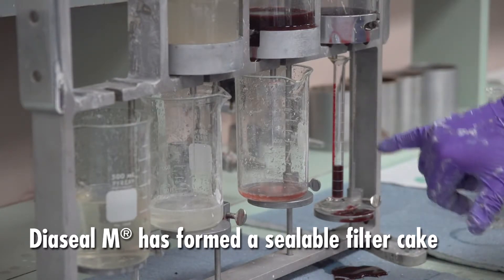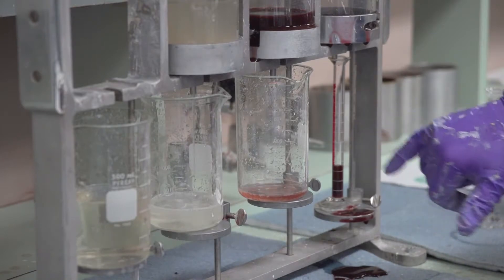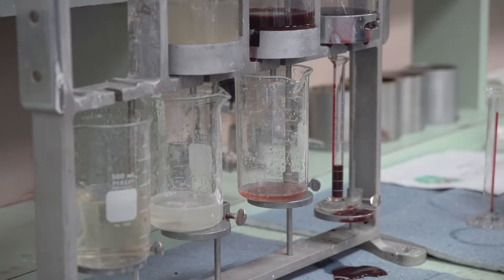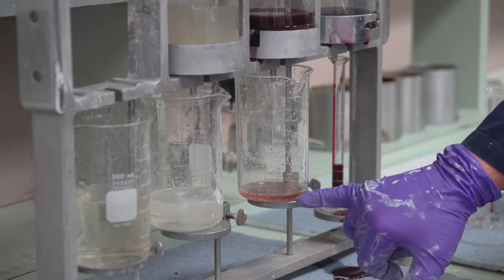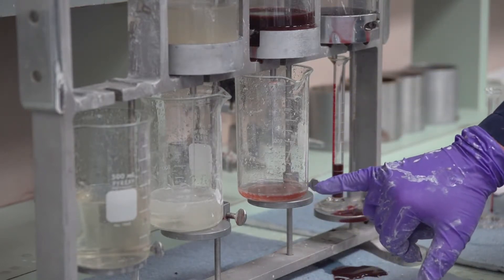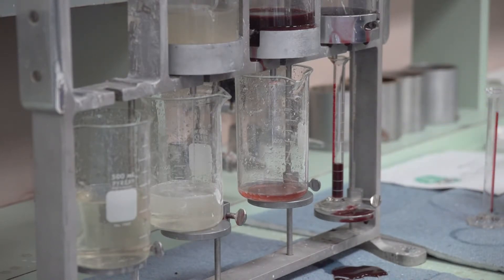You can see the mud itself, if we ran this a full 30 minutes, would be about a 10 ml fluid loss, the API fluid loss. You can see we've squeezed out a little bit more water out of that as we put pressure on the cake. If you're in a downhole situation and you're putting more hydrostatic head, the cake would pack up tighter and we would squeeze even more water out of it.